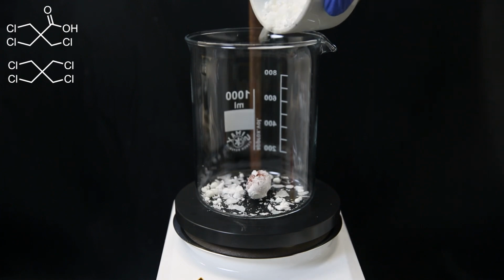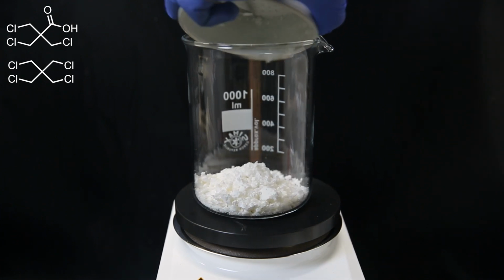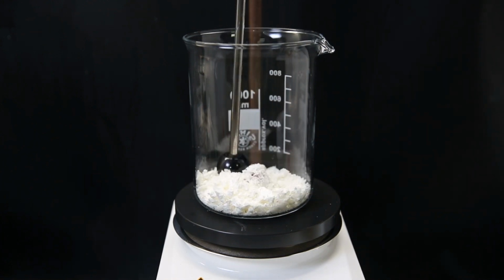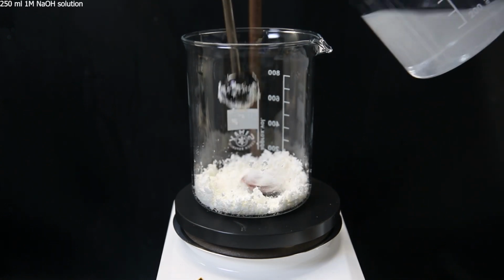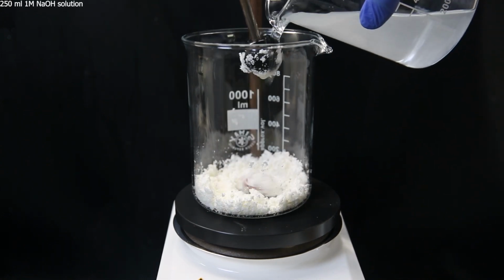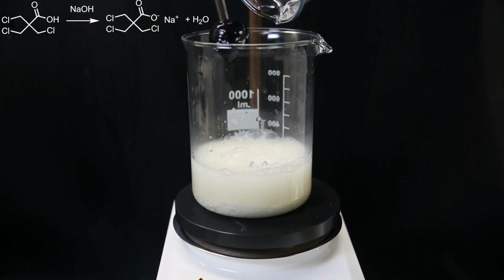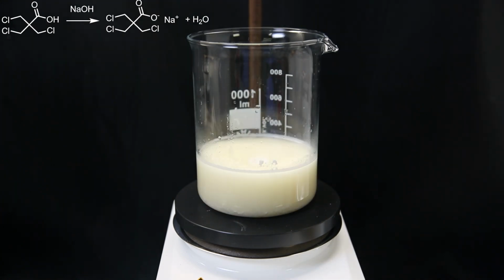This is still a mixture, containing the tetrachloro from before and the new acid product. So I will have to separate them, which should be pretty easy. I tried to crush it a bit with this thing, but it doesn't really work, so never mind. I then add 250 ml of a 1 molar sodium hydroxide solution, which will react with the acid to form its sodium salt and make it water soluble. I leave it to stir for a while to make sure all of the acid has reacted and dissolved.